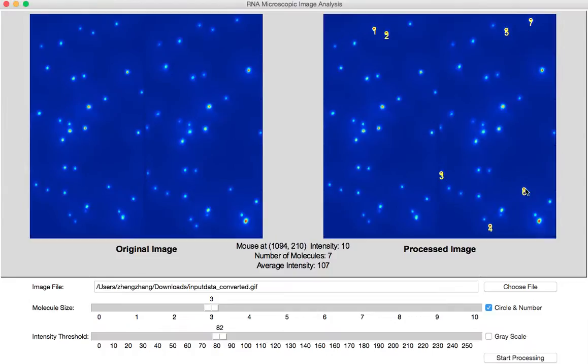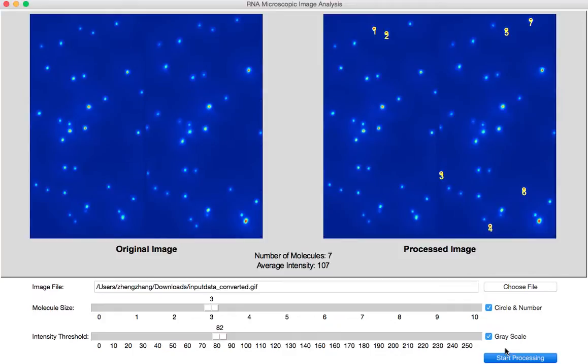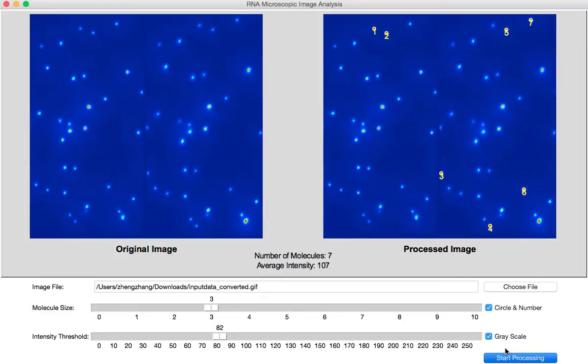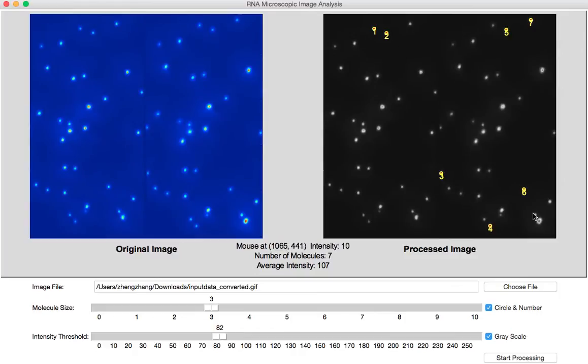We can also do some background noise reduction by converting this image into grayscale. We check the box grayscale and start again. There you go. We can see those single RNA molecules are more clearly identified from this image.